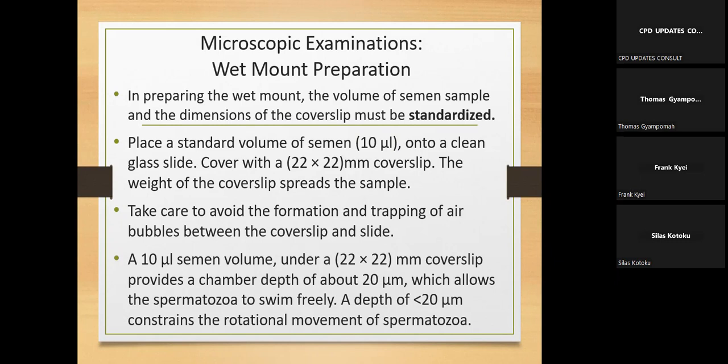The numerator is also going to be 10 millimeter cube, because the microliter is converted to millimeter cube so that it can conform with the millimeter square in the denominator. Now, the millimeter square will cancel against the millimeter cube to give you millimeter. So the result is going to be in millimeters. I hope that you are following it.